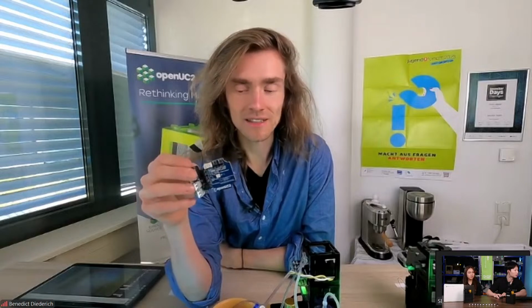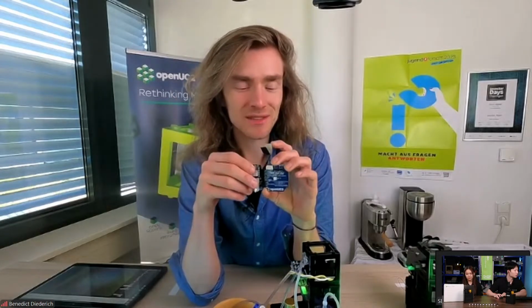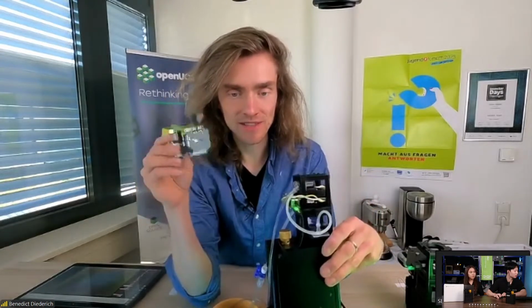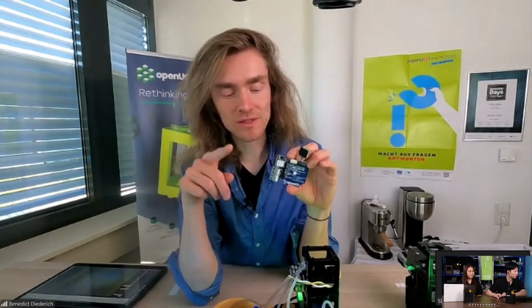So this little PCB here, what I just showed, is just one example of how you can automate your sample system. Ideally, the firmware is there. It's just a bit too risky for this live stream now. The Xiao that is sitting in this device here can automatically connect to this device here using an HTTP connection. So then you have just one app that is controlling both of those devices.